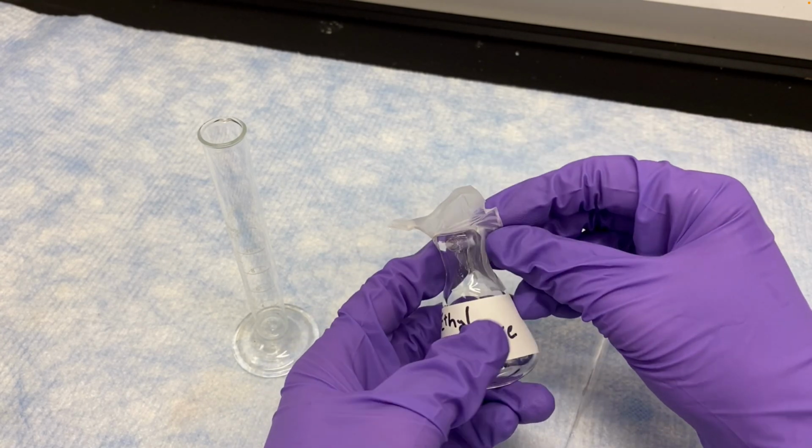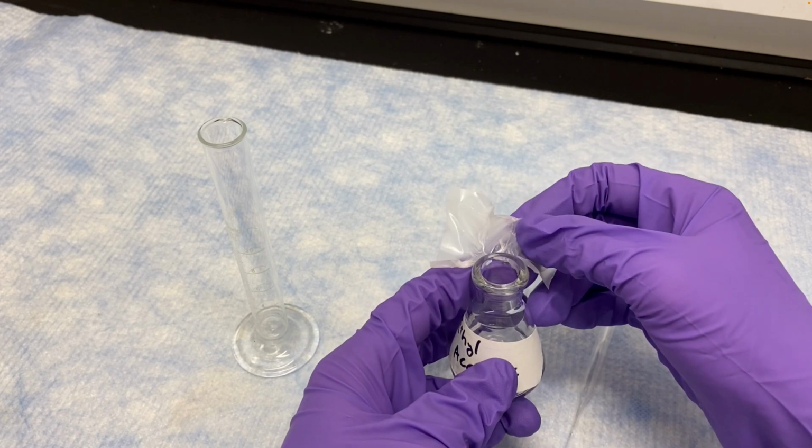So when you're ready to measure this out, you'll of course remove the parafilm. You don't want to destroy the parafilm because you're going to seal it back up once you're done using the ethyl acetate. So you're just removing it from the neck.